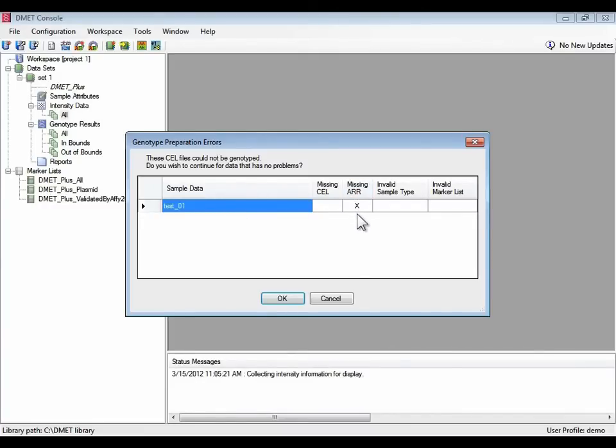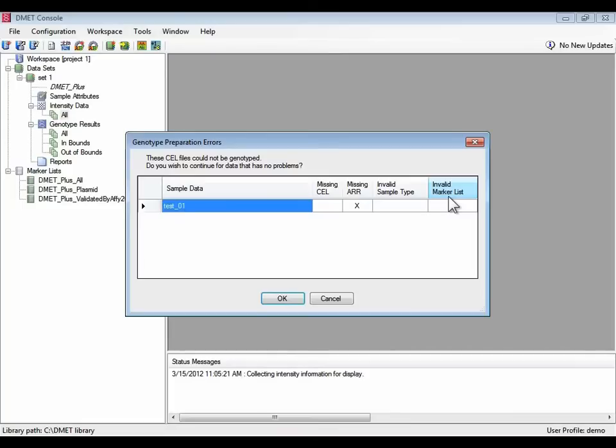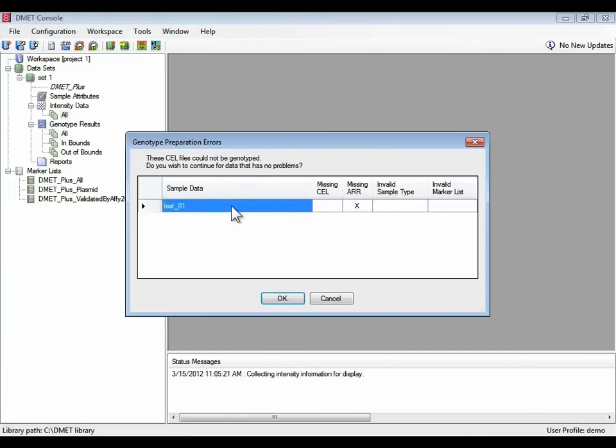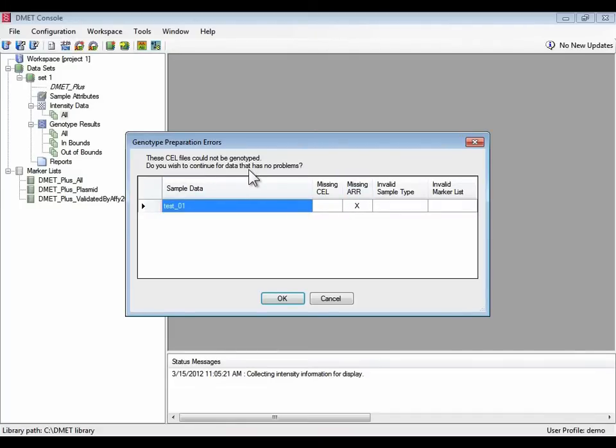There's one more error in the set and that is that the first sample is missing its sample file. A sample file is required for each cell file and not only that, the sample file needs to have a valid sample type like sample or control and a valid marker list listed like DMET plus all, for example. If that information isn't found for a particular cell file, the cell file will not be processed. In this case we're not going to try to fix the problem by finding the AR file. We're just going to continue with the subset of cell files that have no problems.